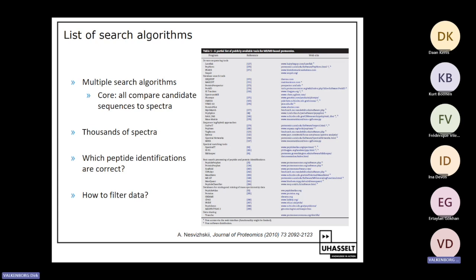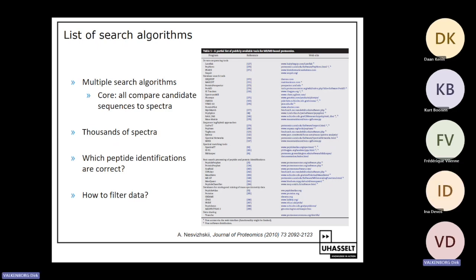It ends up with a huge pile of data, and we have seen some bioinformatic solutions to blow through this data. As a conclusion of last session, we have a list of various search algorithms. There are many, but the basic principles hold and were explained in the previous session.